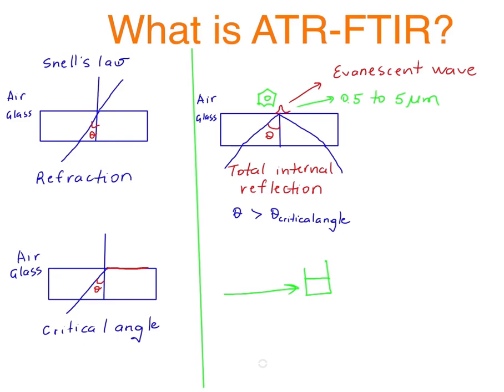In ATR, the evanescent field is non-propagating. It remains confined near the interface, and then it rapidly decays. That's why they call it non-propagating. This is why ATR FTIR is inherently a surface-sensitive technique. It all depends on the surface, the excitation of the sample and absorption. Everything happens on this surface between the glass or crystal and air.